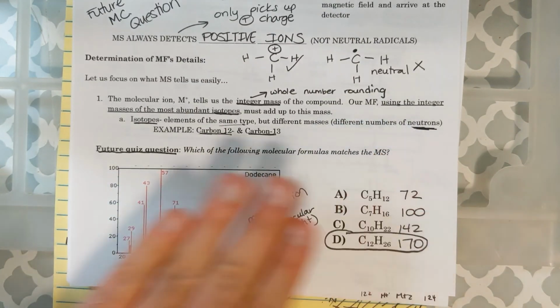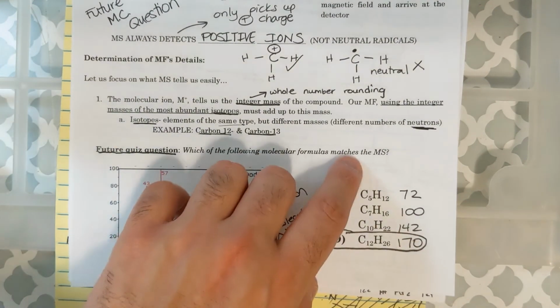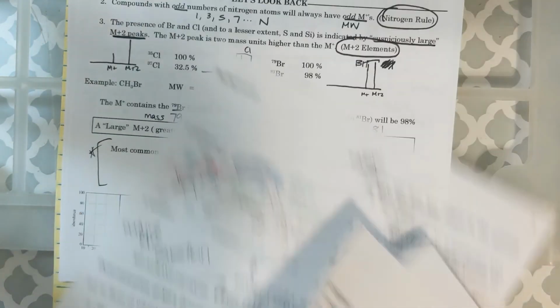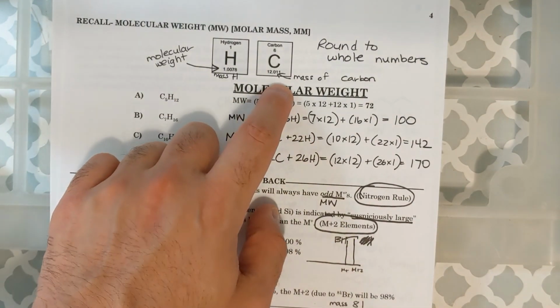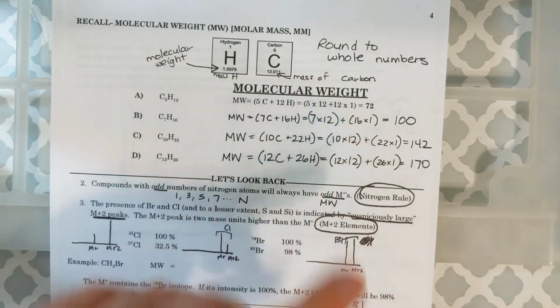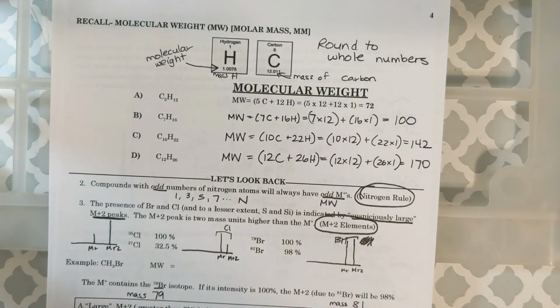We then did a sample quiz question in which if I give you a mass spectra, you have to choose the molecular formula that matches the mass spectra if it matches the molecular weight. And then I quickly showed you how to calculate molecular weight as a little bit of a recall, just using the periodic table and the masses of the elements rounded to the nearest whole number. Adding up all the different elements in the compound gives you the molecular weight.